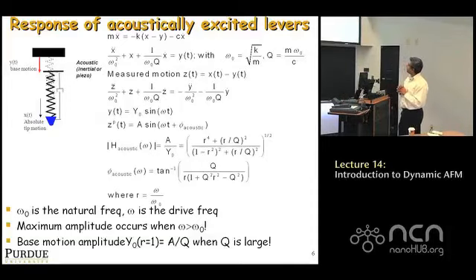So as R equal to 1, you see that the first term in the denominator vanishes. And then let's take Q being large. So in air, for example, Q is 100 or 200 or 300. In that case, the second term in the numerator is small when Q becomes 100 or larger, okay? At R equal to 1. So for large Q and for R equal to 1, you basically have A over Y0 equaling Q. That's it. Okay, thank you. Right. So that's a very important result.